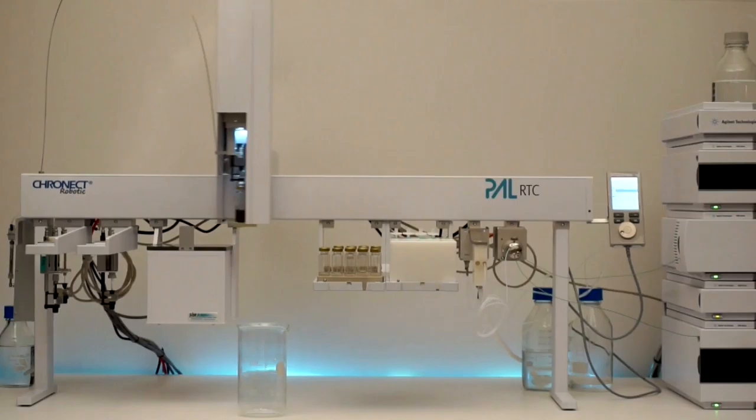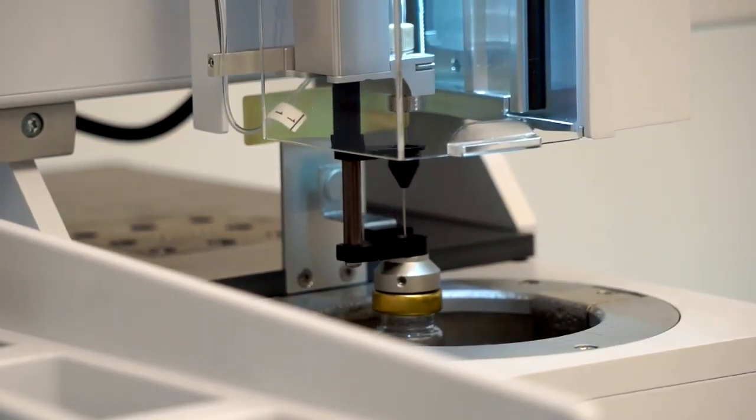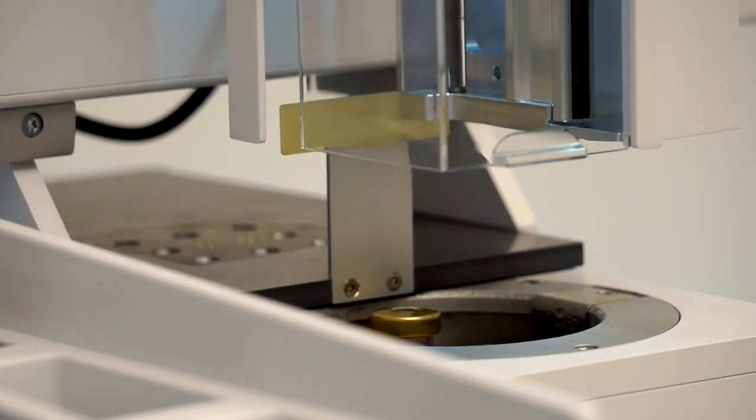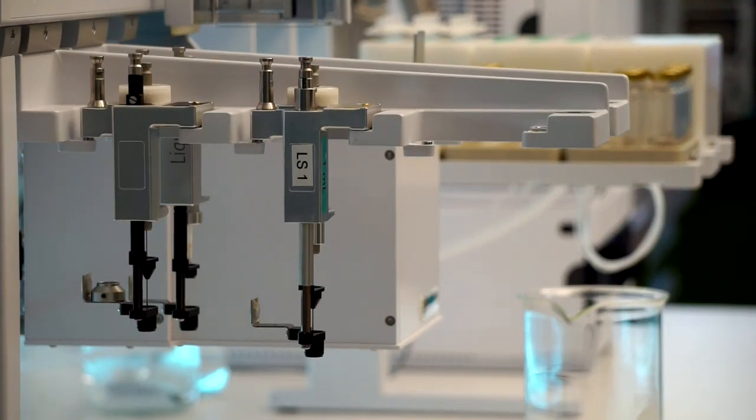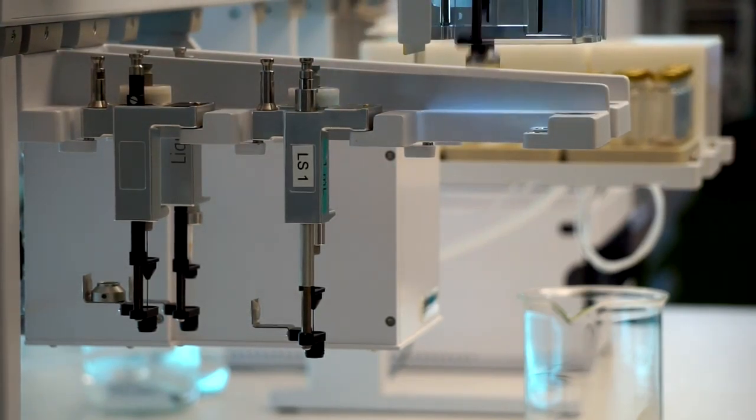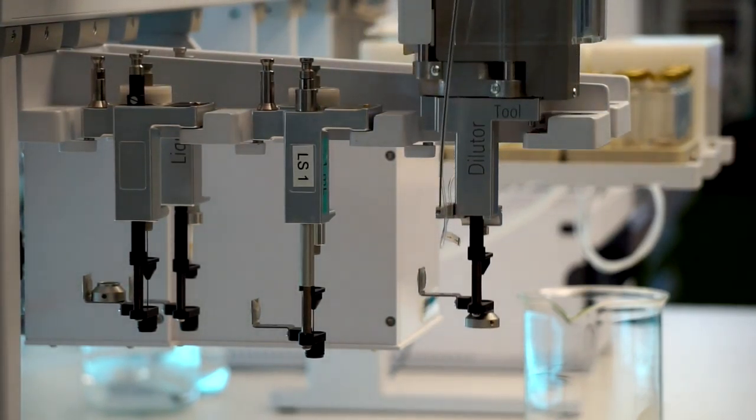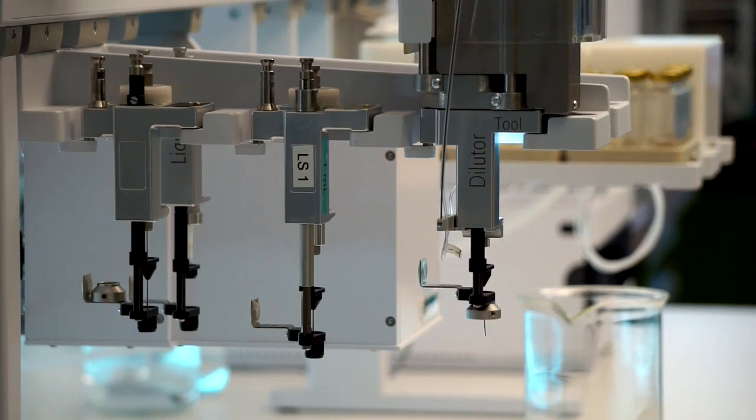The dilutor tool opens the cover of the ultrasonic bath and puts in the sample vial. The ultrasonic bath is turned on. Meanwhile, the tools are exchanged. The 1 ml syringe tool is required to transport the 2 mL sample vials.